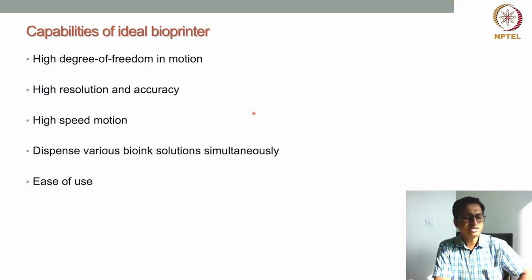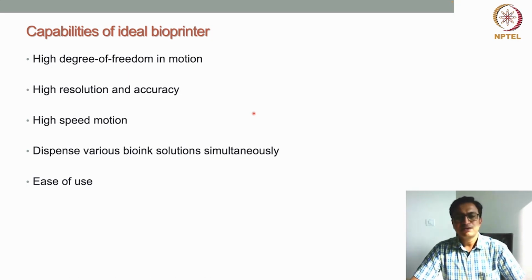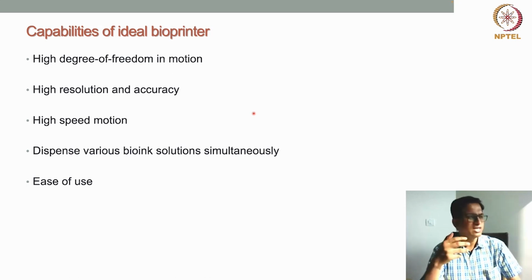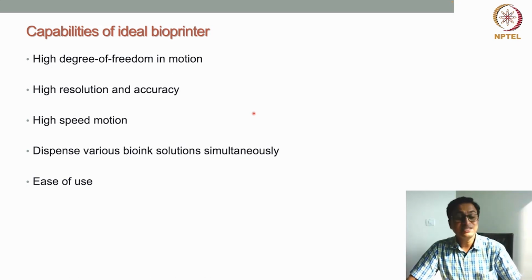Nowadays some printers are available that allow dispensing various bioinks simultaneously. Other thing is ease of use.